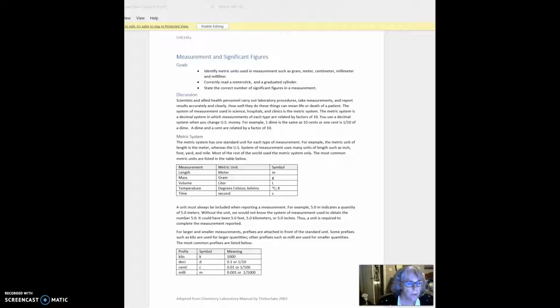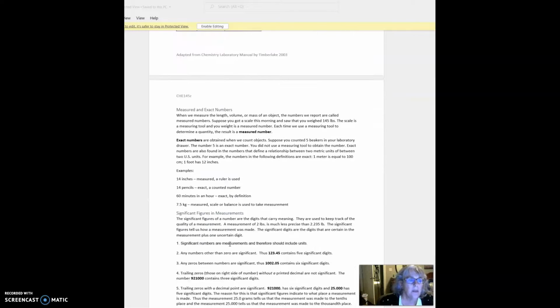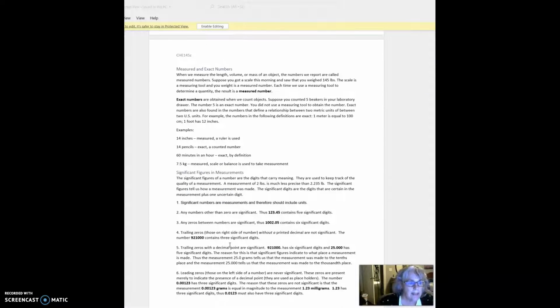I wanted to make just a short video to go over this lab because so many people have so much trouble with it. I think one of the first things they do is they don't read this initial discussion part carefully. But make sure you read about the metric system here. You'll be making all your measurements using the metric system.